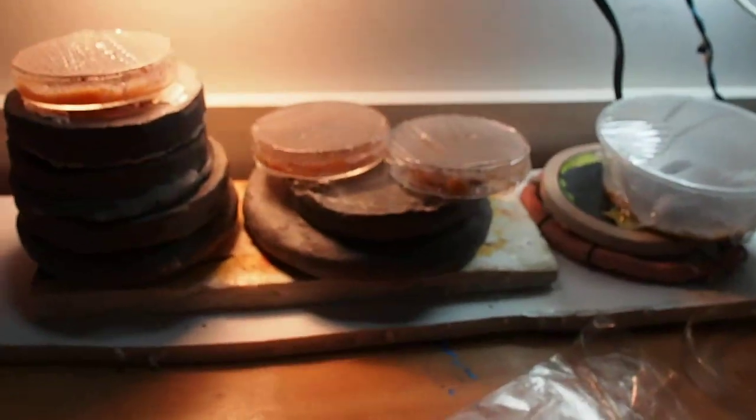And I think that those cultures here are kind of ready to be picked. So what I intend is to take a little bit of germs from the culture, and maybe mix them with a little bit of purified water, and to stain it. So I'll have experience with staining original biological material, and then I will stain material which was created by the neos.